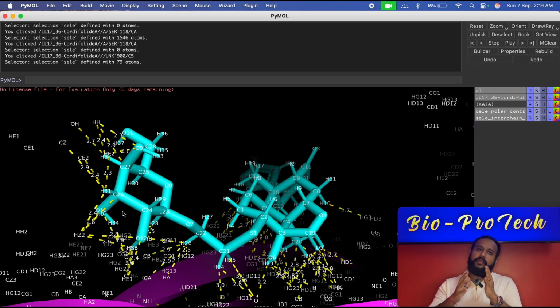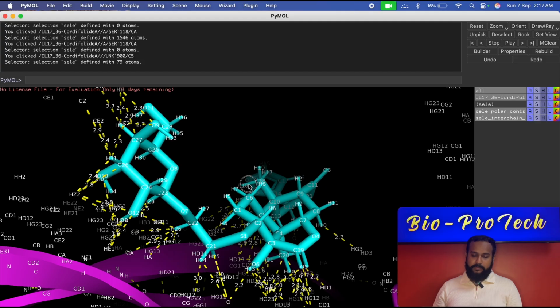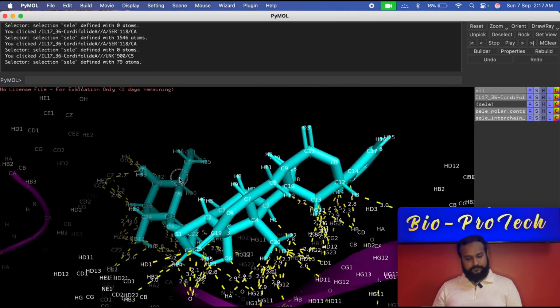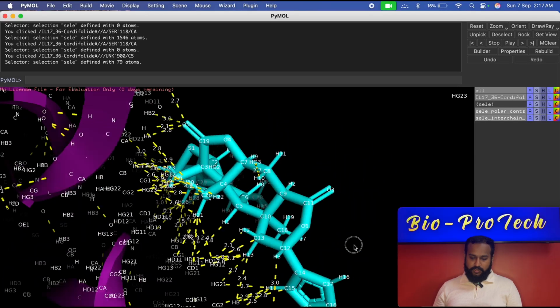Basically after docking, you can look at that particular tool. Let's suppose you are doing it using SwissDock. You can click on that and see the interactions over there, what are the bonds it is supported using. Apart from that, you can also learn the interaction from your 2D representation from your Discovery Studio and all. Apart from that, you can also come to the 3D representation for cross validation using your PyMol, Rasmol, Chimera, and this that.